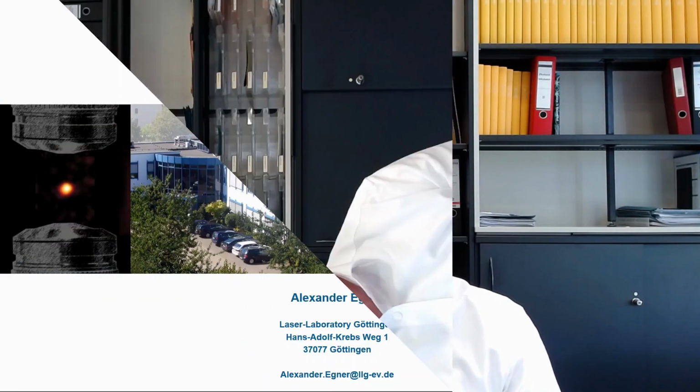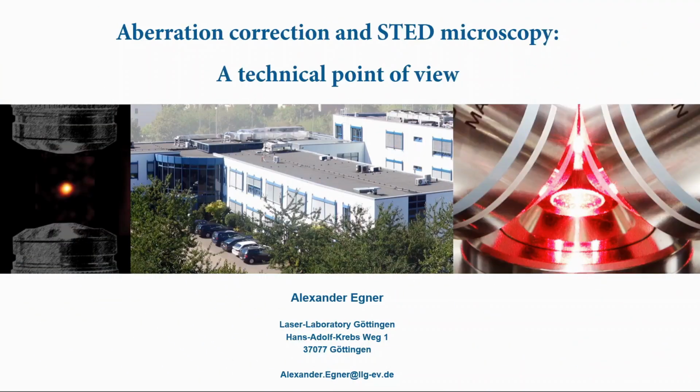This is, of course, not only true when working with super resolution, but if we are working at the highest achievable resolution, we want to avoid all potential perturbations to our experiment. In my presentation, I will deal with the question of what adaptive optics is already capable of today, and to what extent it can be used in biomedical research in the future without the user necessarily having special optical knowledge.